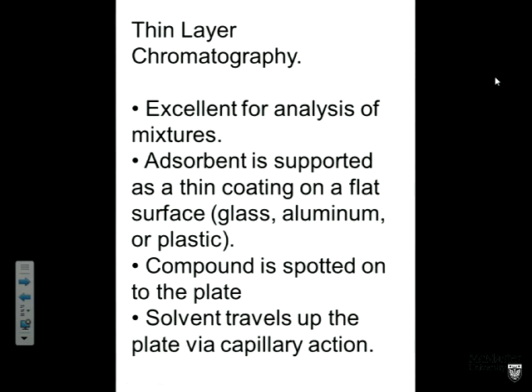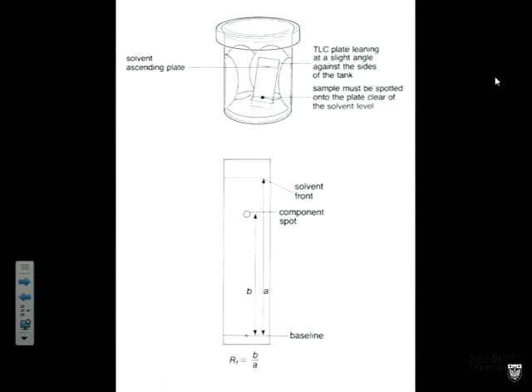We do something called spotting the compound on the plate. So we put a little spot of my compound onto the TLC plate, and you'll do this next week. And then we place the plate into a jar containing solvent. And solvent travels up the plate via capillary action. So here's a picture of that.